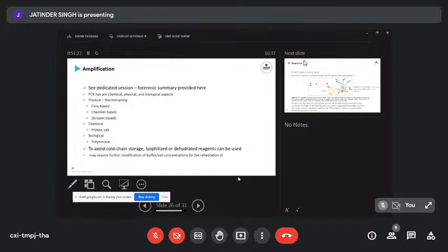For amplification, we've got a special session on DNA. PCR, the polymerase chain reaction, requires thermocycling. There are a couple of different ways that's been done. Different commercial instruments actually use different approaches, but the most popular are the ones based on a chamber where a heater ramps up and down, rather than having the PCR sample circulating, flowing over electrodes with different thermal zones.